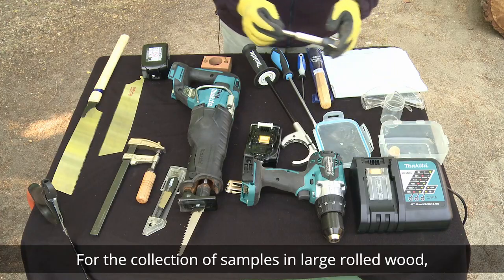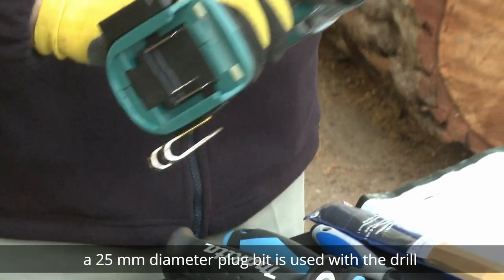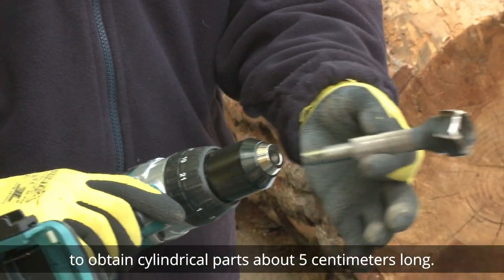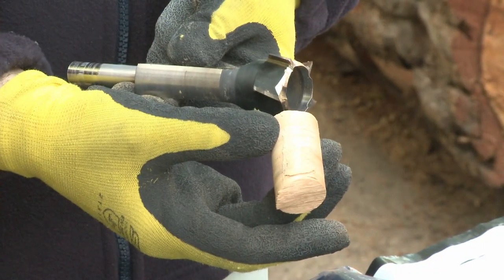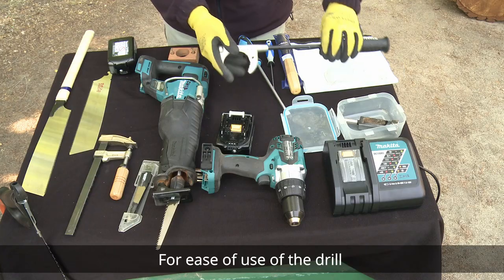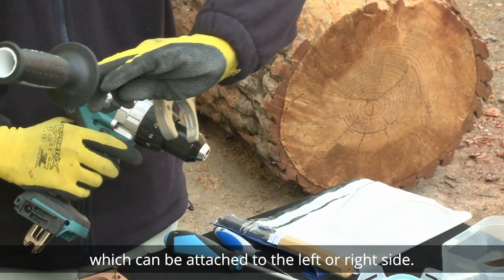For the collection of samples in large rolled wood, a 25mm diameter plug bit is used with the drill to obtain cylindrical parts about 5cm long. For ease of use of the drill, a grip is included, which can be attached to the left or right side.